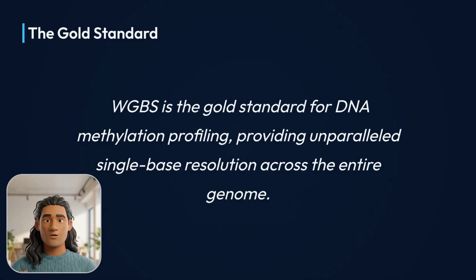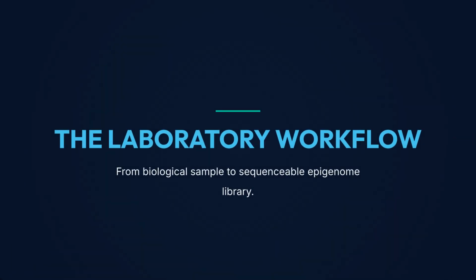WGBS is widely recognized as the gold standard for DNA methylation profiling. It offers unparalleled single-base resolution across the entire genome, as highlighted by the Epigenetics consensus. We now move to the laboratory workflow, detailing the journey from a biological sample to a sequenceable epigenome library.